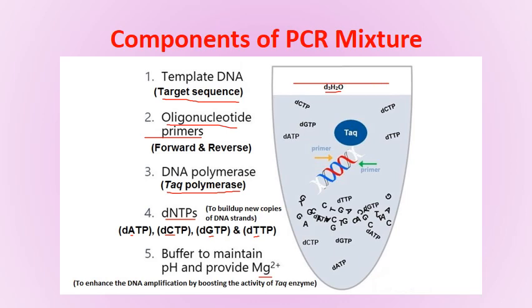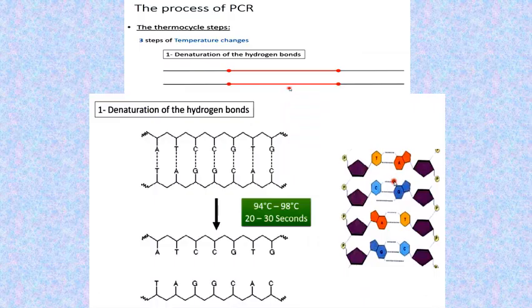Okay, and maybe covered with mineral oil to prevent the evaporation. What is the process of PCR, or what is the procedure of PCR, and how does PCR work and its steps?